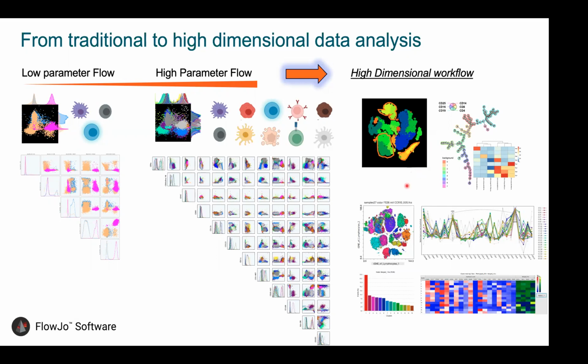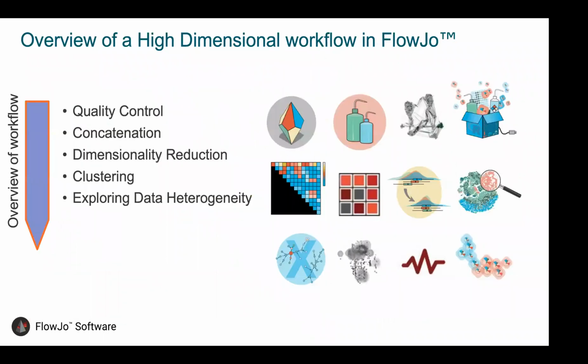We're going to perform clustering. So you might have heard already of FlowSOM, X-Shift, or PhenoGraph as clustering algorithms. And we're going to use additional visualization tools such as Cluster Explorer that you can see here in order to identify what the clusters correspond to and what is the signature expression of each one of those.